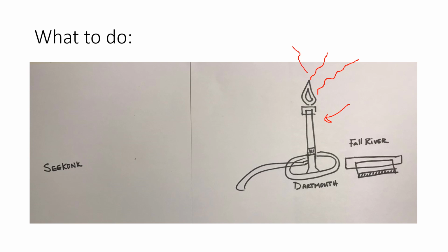So as this hot air is rising away from the flame of the Bunsen burner, it's providing almost like a barrier or a sterile field that keeps cold air out here from falling into our petri dish, if that makes sense. So we always want to work near our Bunsen burner under the sterile field.